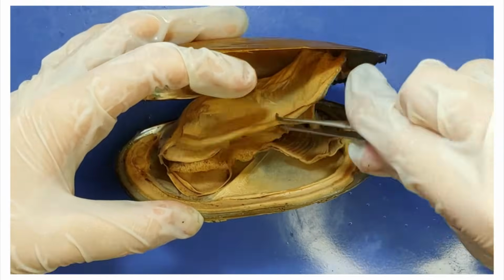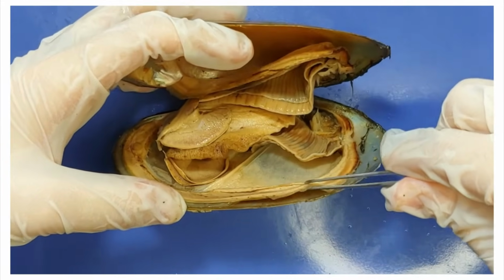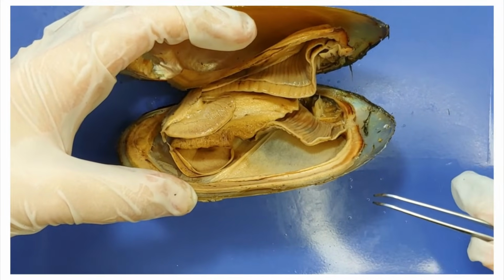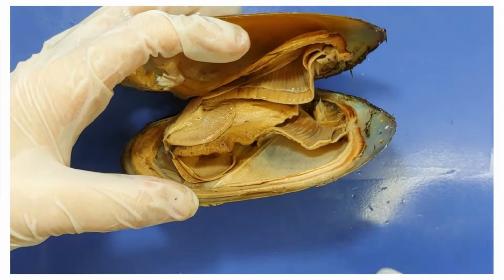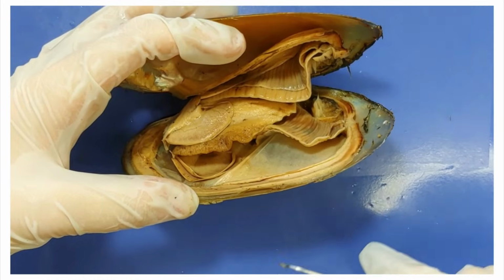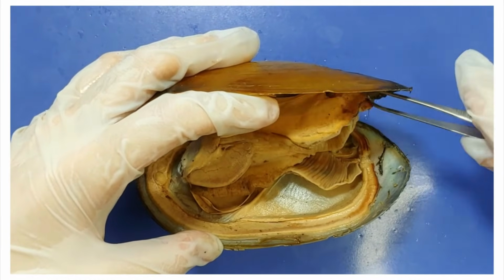The clam has two mantles, one for each shell. The mantle makes the shell by secreting proteins and minerals. When clams die and leave their empty shells behind, hermit crabs may take the shell to live in, because hey, it's free real estate. Now I'm going to try to peel back the mantle.